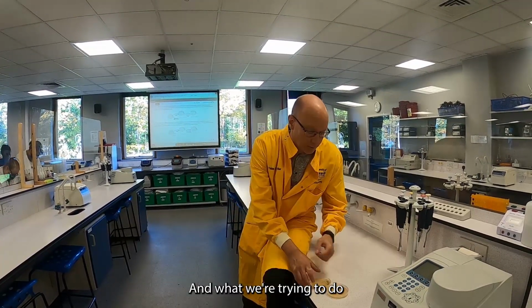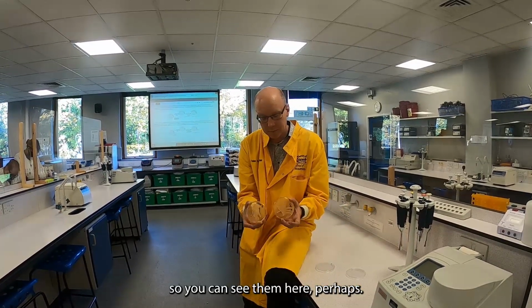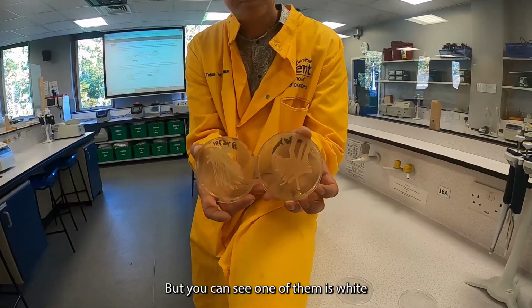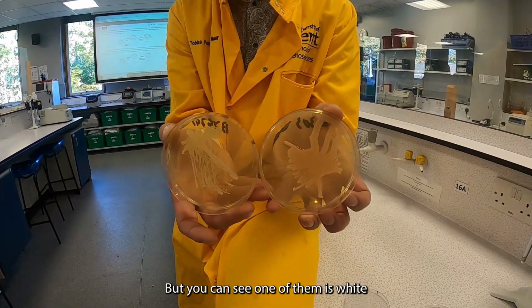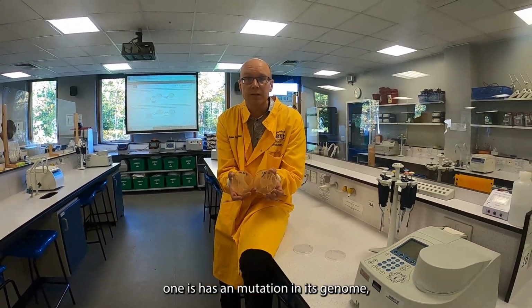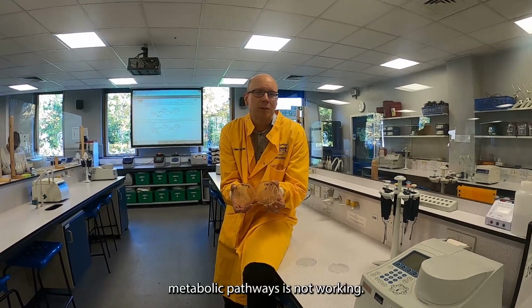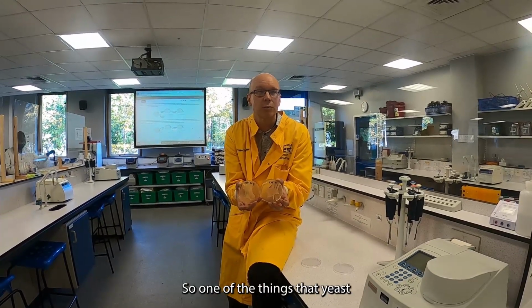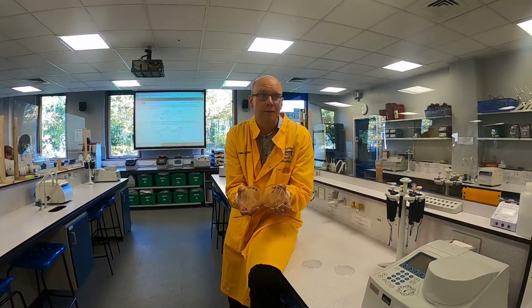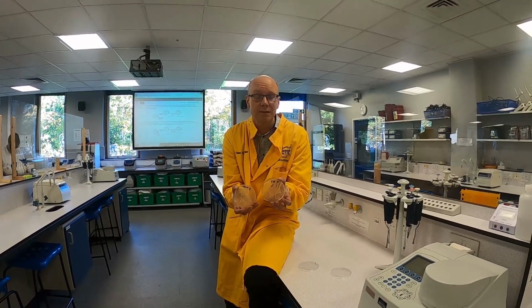And what we're trying to do is we have two yeast strains. So you can see them here, perhaps. I don't know how easily that's visible. But you can see one of them is white and one of them is red. And the red colored one has a mutation in its genome, which means that one of its metabolic pathways is not working. So one of the things that yeast can normally make, a chemical agent that's called adenine, can't be made in this yeast.